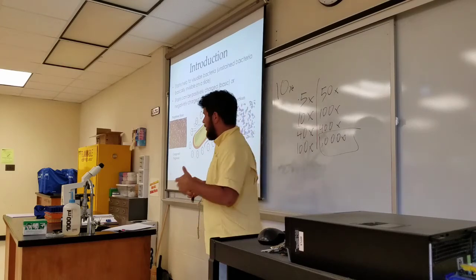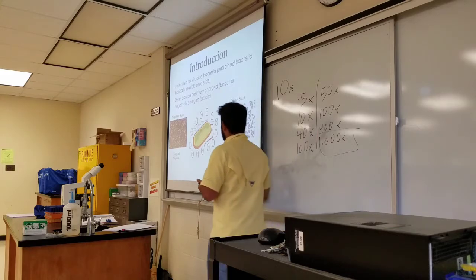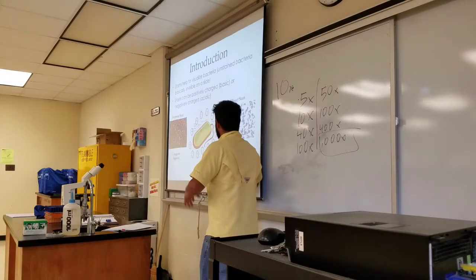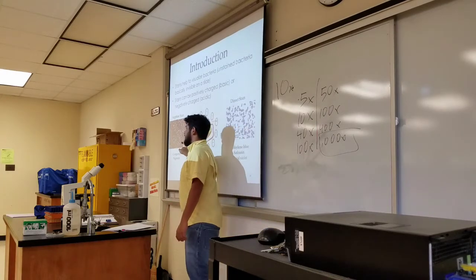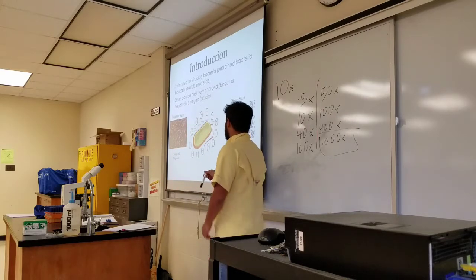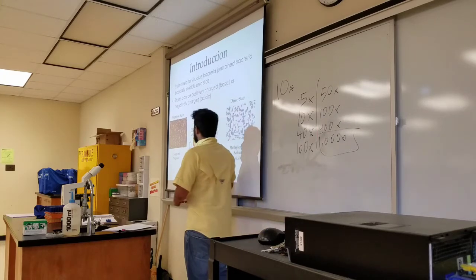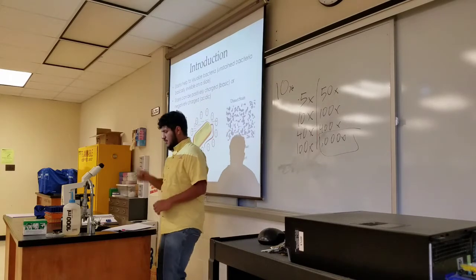Staining is a technique that everyone uses in order to make material visible under a microscope. When we're talking about direct staining, there are two kinds of stain: a positive stain or a negative stain. The difference is that positive stains, or direct stains, are positively charged, or partially positively charged, whereas negative stains, as their name says, are partially negatively charged.